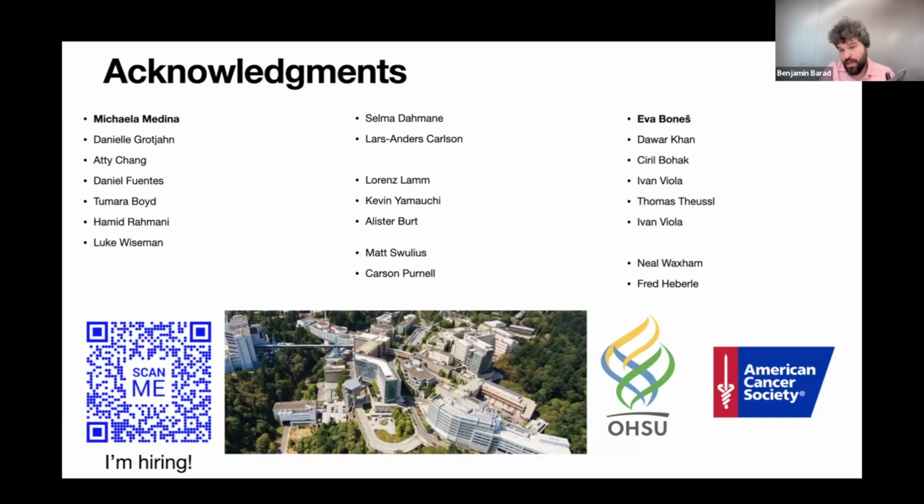There's a big challenge with it. Those tomograms I was showing you had a field of view of 1 micron by 1 micron. When you're thinking about co-localization with typical fluorescence, you're getting maybe a 200 nanometer radius spot, right? Your resolution is quite limited. So you can find yourself in the right quadrant of the tomogram, but it's very hard to say, oh, this specific part of this membrane has these features.